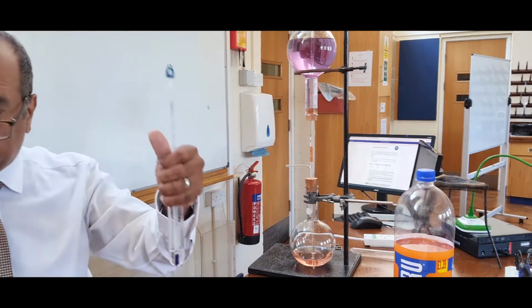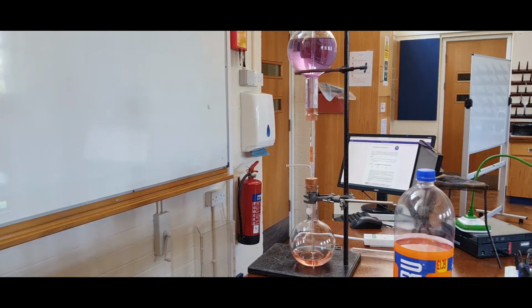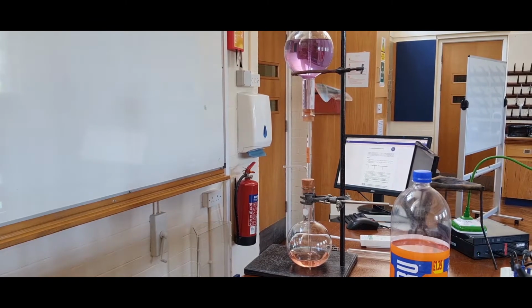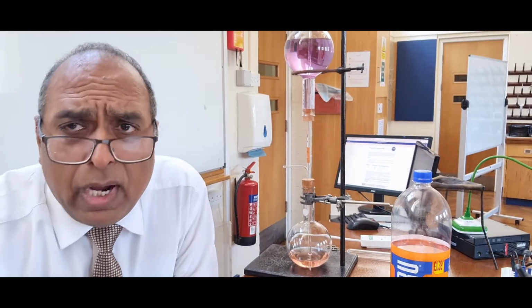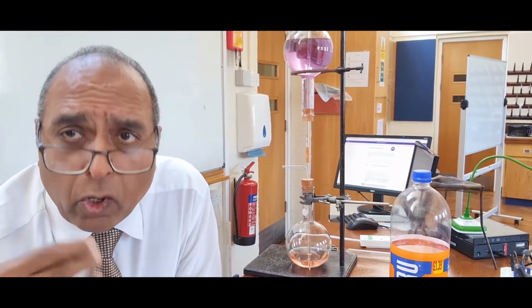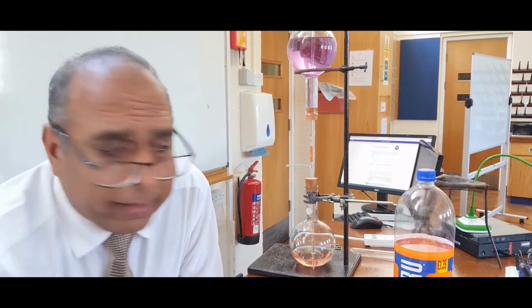I can't get crystals to form, so I'm just going to keep the cold tap running on top of that boiling tube I was showing you. While I do, I can run through the calculation on the board.